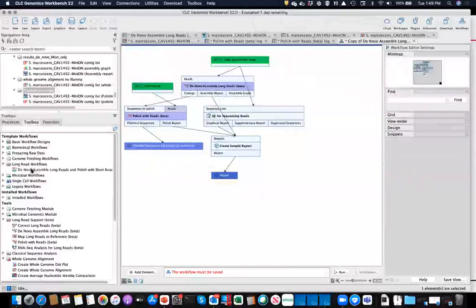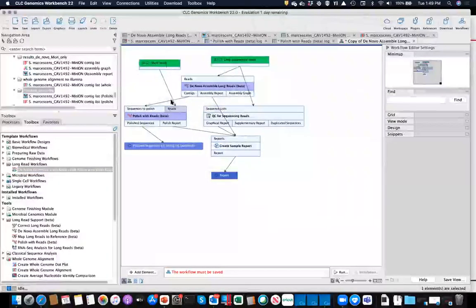And then at the end, I was going to just say, simply run this, and then you wouldn't have had to do those separate steps. But you'll still notice that there's a de novo assembly and then a polishing. I could take that question two ways, where one way was that I don't do the polishing step, and the short reads go right into the de novo assembly. That's not as efficient, because you end up with a lot of reads, and it's just not an efficient way of going about it within our tool.